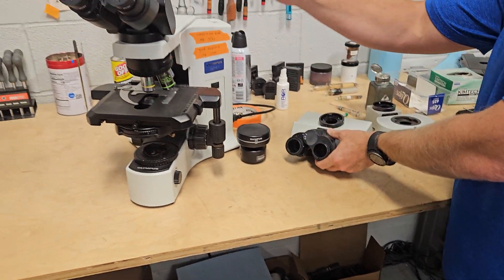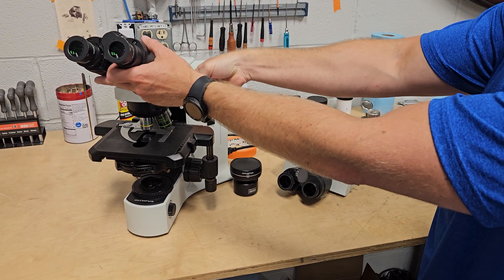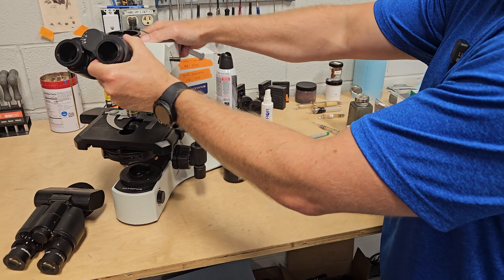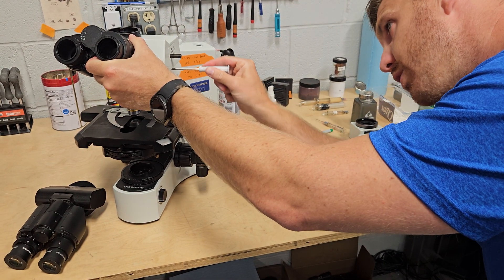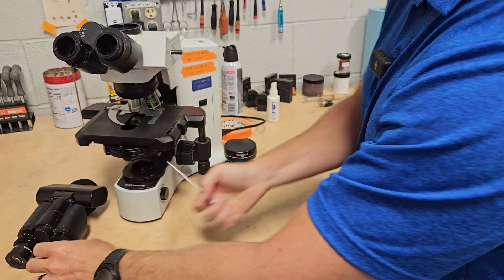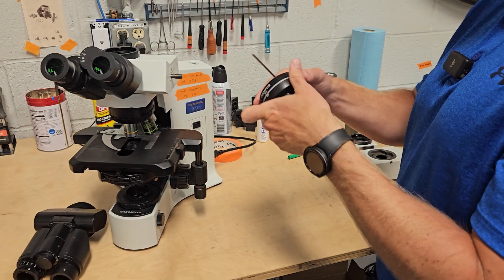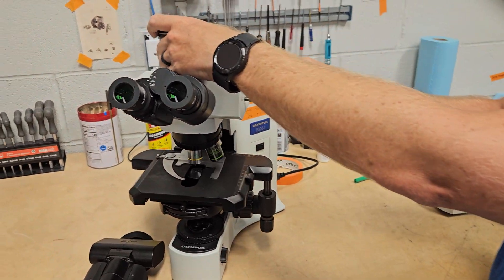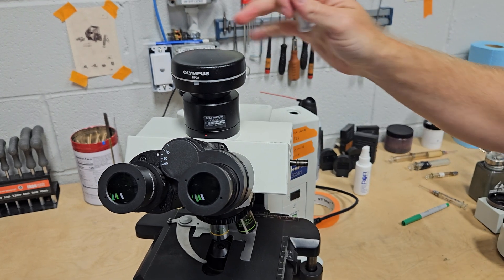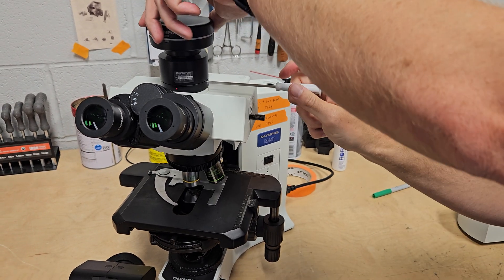You can change the heads out by using your handy three millimeter Allen tool right here. Once you add this trinocular head or change it out, you would just move your eyepieces over and then add the camera adapter. You would plug your camera into your computer system and you would be ready to go. We have another video on this but we're going to go over it real quick.